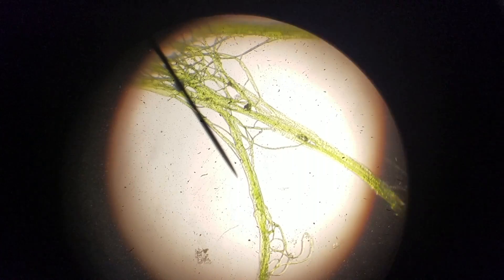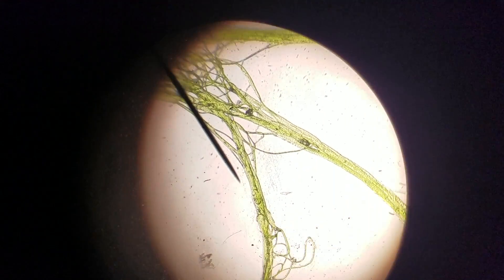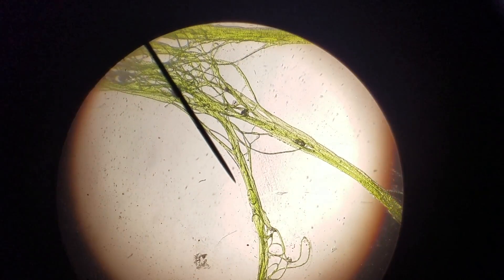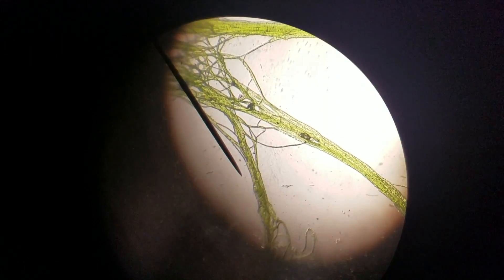You can also see around the outside that in the clumpy areas it gets darker green, and that there is kind of a slime coat on it — which is different from the white of the light from behind. This also has single cells; you can see them in each strand if you look carefully.